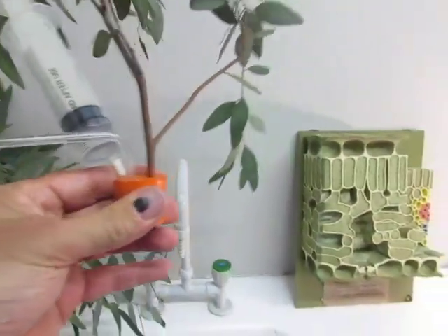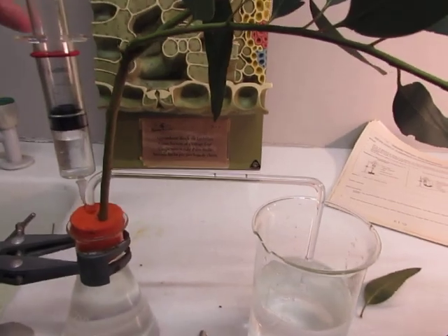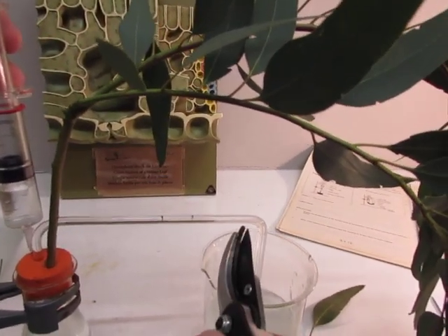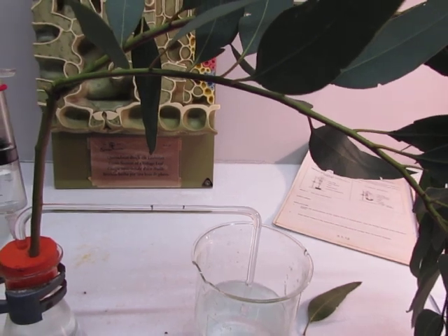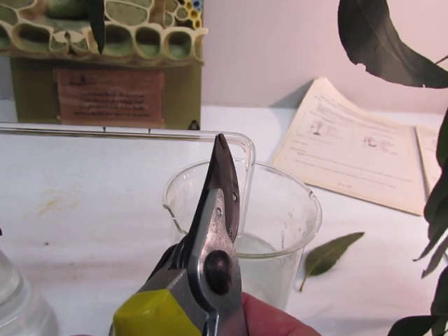I've already done it with this setup, so I'm going to show you what happens. If I press the syringe, you might be able to see the small tiny air bubble in there. And I'm very interested in the movement of that air bubble. Can you see it move? There.